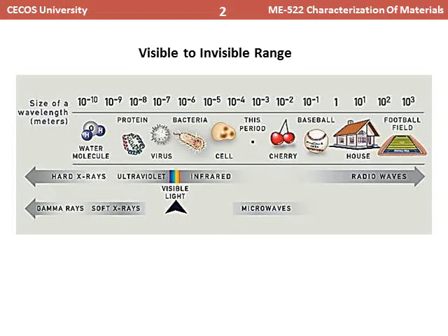The light microscope that you use in your 9th or 10th grade, or 11th to 12th grade, or maybe in your bachelor classes, lets you see the size of a cell and even bacteria, which is in the range of 10 to the power minus 4 to 10 to the power minus 6 meter.